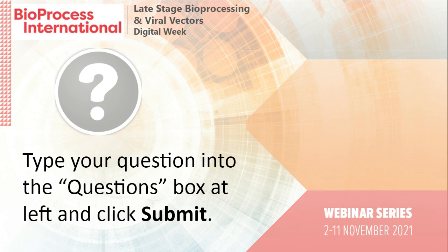So at the moment, this is not available as a kit. If we're speaking about PATfix valve switching, it is a special configuration of an HPLC system. Columns which are used for this type of analytics are, however, available. You can purchase them separately and do some less complicated analytics. But in order to do valve switching, you would really need this type of system.